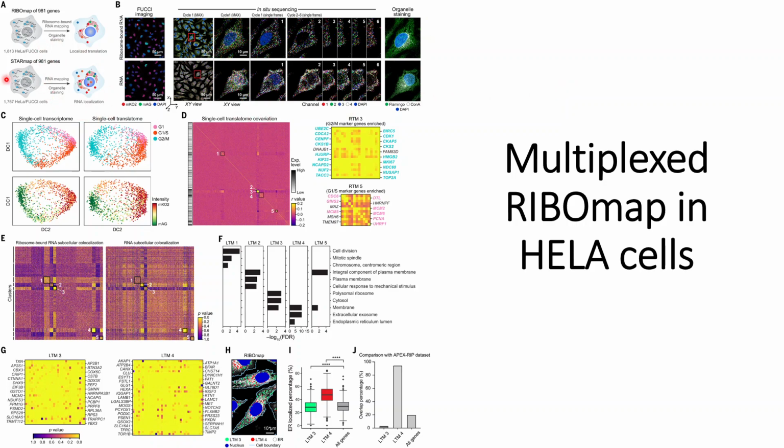In this video we will discuss the multiplexed RIBOmap experiment in HeLa cells, where they compared this multiplex experiment with the competitor, that is STARmap.